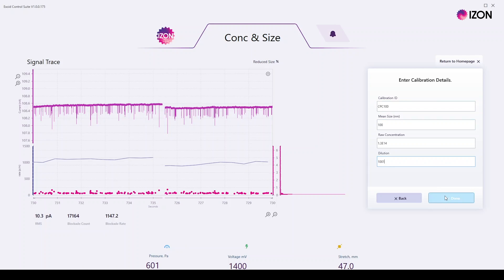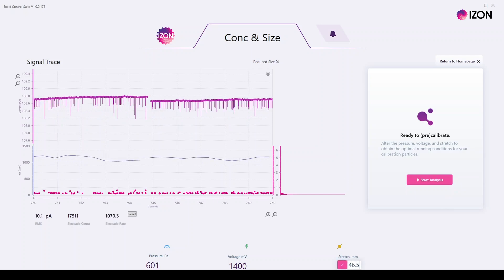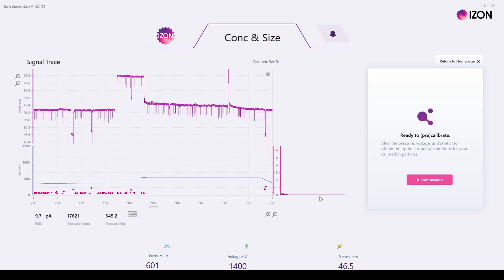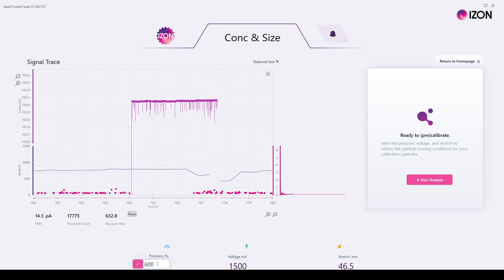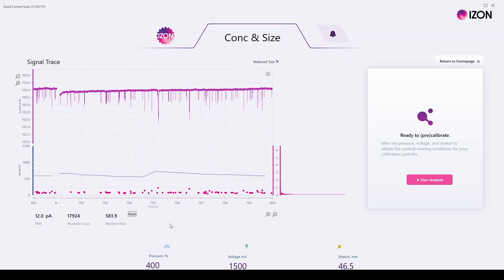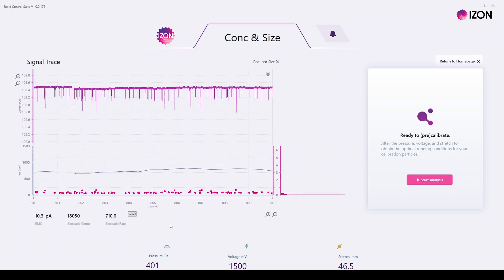While this is perfectly suitable for a calibration, you can adjust the parameters to get a better signal-to-noise ratio and therefore better data. Signal-to-noise can be improved in three ways: reducing the stretch, increasing the voltage, or reducing the pressure, as each of these will result in an increase in the relative blockade size. However, there are some things to consider: the stretch increases the chance of blockages occurring, increasing the voltage may increase the noise, and decreasing the pressure reduces the particle rate, making measurements slower. This makes setting your conditions an important but delicate balancing act before you begin.